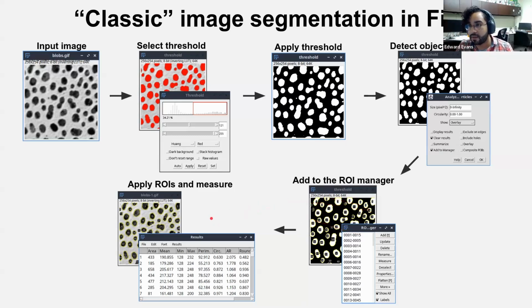It is kind of what I feel like a lot of people don't quite capture, is that you want to transfer those ROIs onto your original image so that you can actually get the measurements, maybe like the mean intensity of your regions of interest or things like that. So that's generally the flow of segmentation, and it can take different forms.